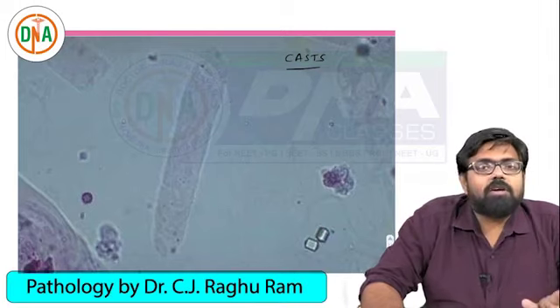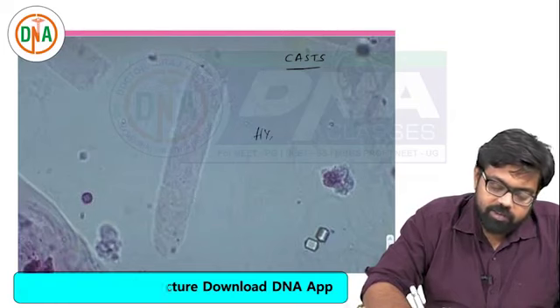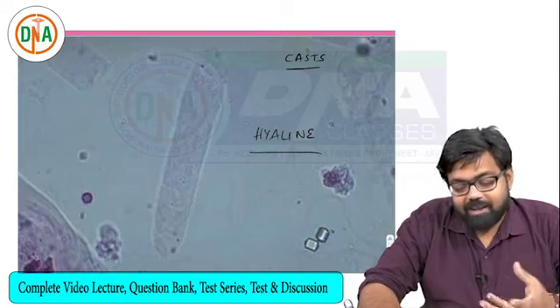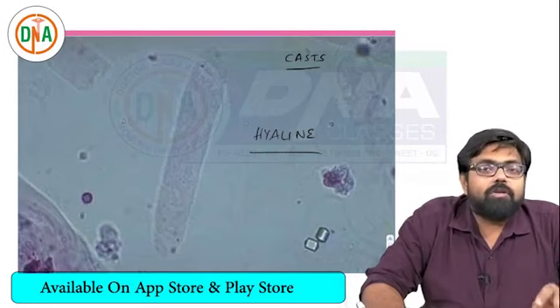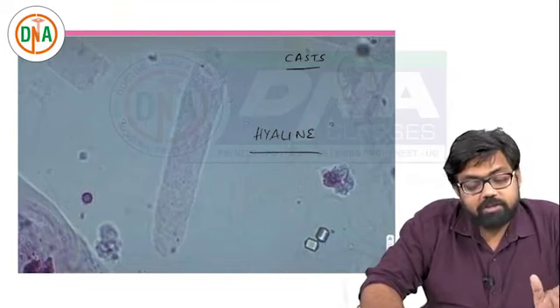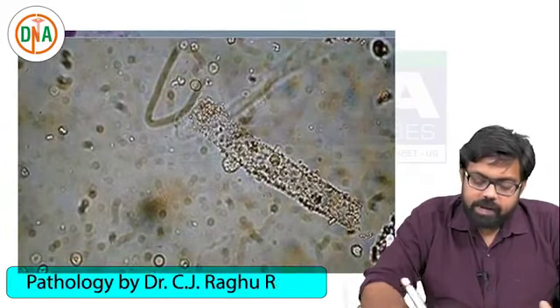Generally, in dehydration or severe exercise, you come across a cast which can be seen even in normal healthy individuals. That is called a hyaline cast. Why it is called a hyaline cast is that it is somewhat glassy and transparent, which you can only make out if the illumination is much decreased. You may also come across a question: which of the casts is not pathological? The cast which is not pathological is the hyaline cast, which can be seen in normal individuals or even after strenuous exercise.